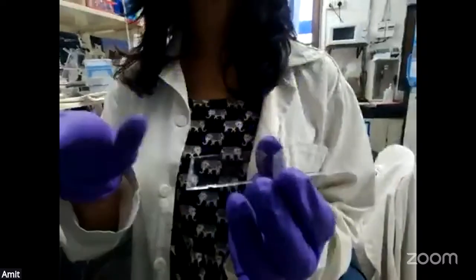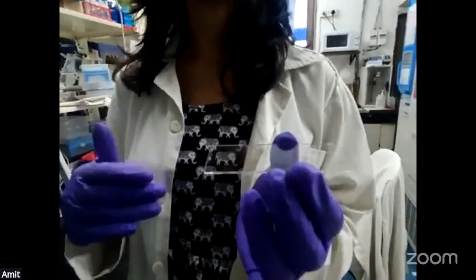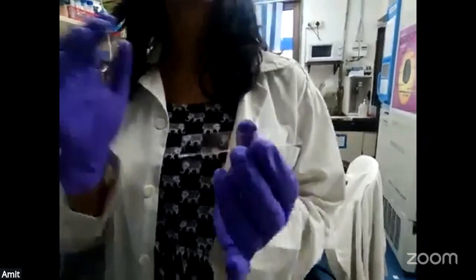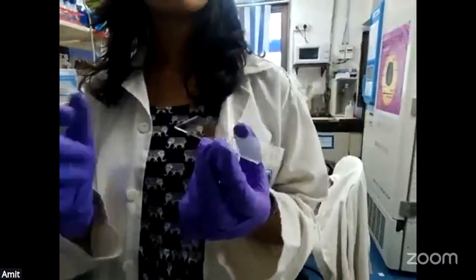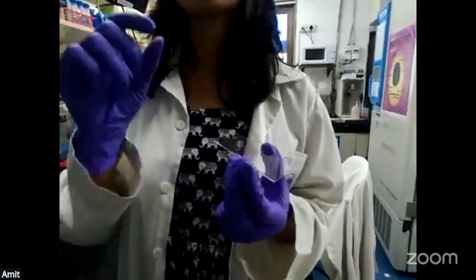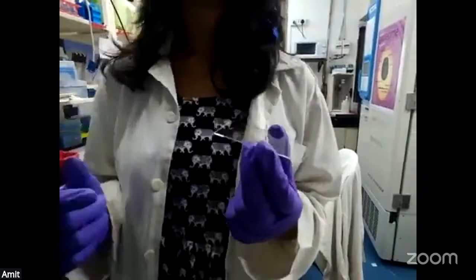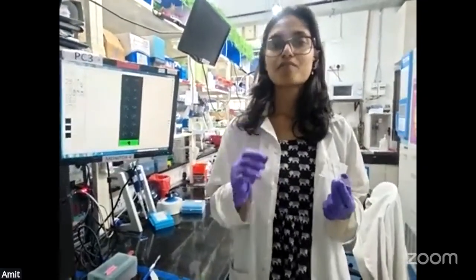We put a layer of our analyte. In this case, we put protein, because let's start with a protein microarray. So we have immobilized a layer of protein on this slide, which obviously we cannot see because it is on a very small scale. And then we incubate with primary antibodies. Primary antibodies are present in our sample, for example, if we take a blood sample, serum sample, etc. Those primary antibodies will be specific to these proteins, or let's say antigens.